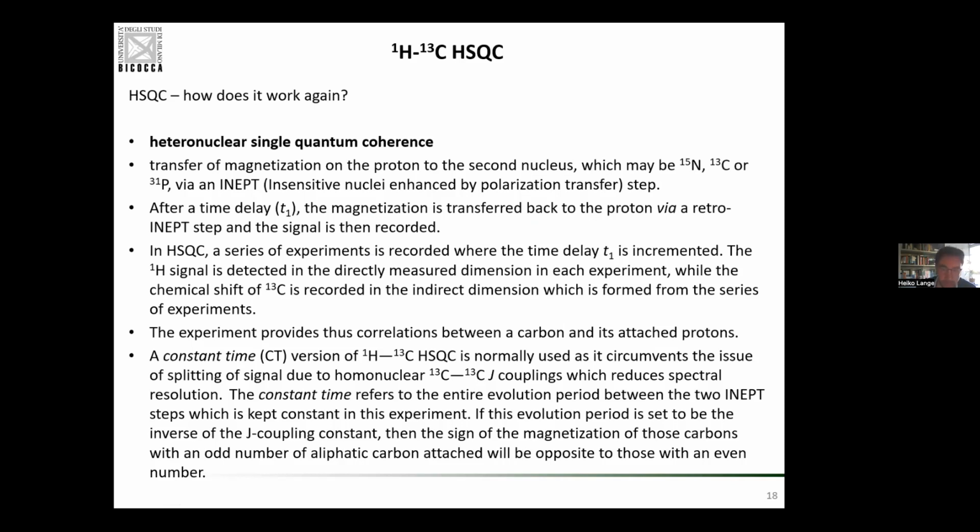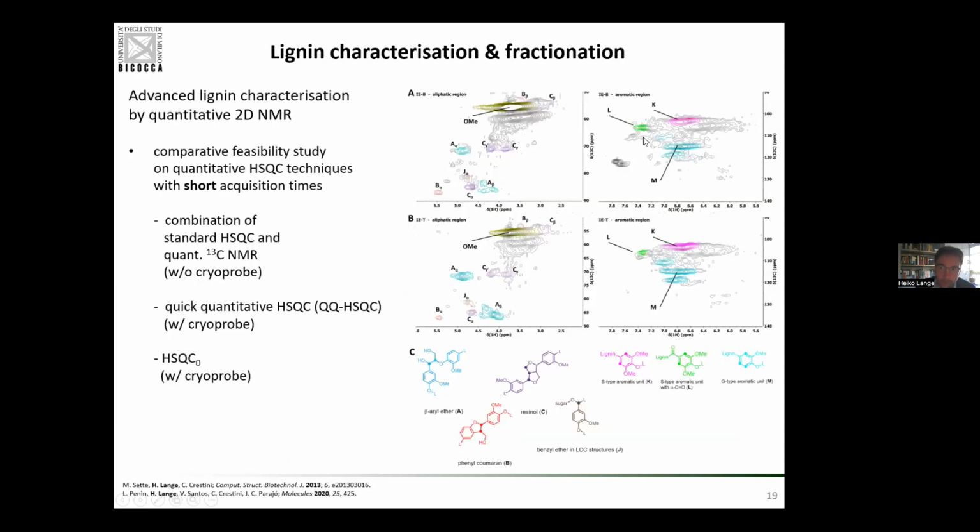Since time is flying, I quickly give you a background for the HSQC. So HSQC is different. HSQC is not a one-dimensional NMR. HSQC is a two-dimensional NMR. And the problem with the two-dimensional NMR is that it is not intrinsically quantitative. If you see in publications these nice HSQC spectra, colored, non-colored, those HSQC spectra always look the same by the naked eye.